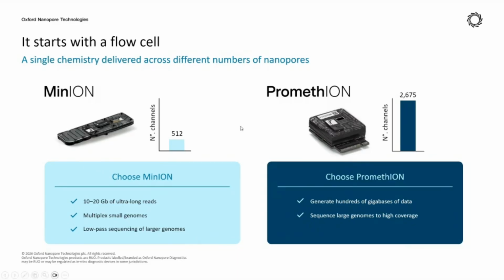But for human whole genome sequencing, or the one with adaptive sampling, even though adaptive sampling is a targeted sequencing, most of the time we still need a larger data throughput. So that's why the other flow cell is there. This is called the PromethION flow cell. It can generate, I think, 100 to 200 GB of data per flow cell in one sequencing run. So the data throughput is just nice for one whole genome sequencing. And of course, for other larger genomes, this one will also be suitable.